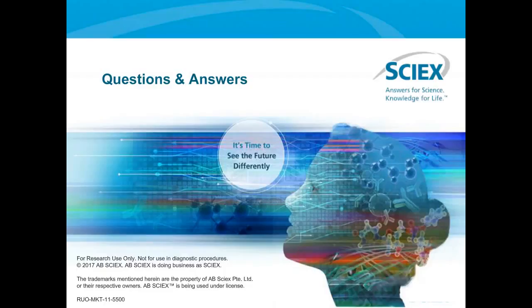How about the in-between samples capillary equilibration time? We don't need any capillary equilibration time between the rounds because we replace the buffer system itself, and it's the bare silica capillary with a low pH buffer, so we don't need any equilibration time. We can just run the samples straight right after each other.